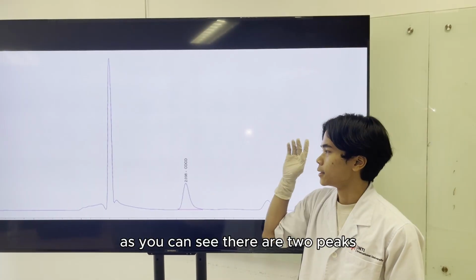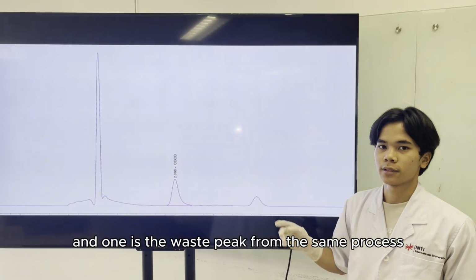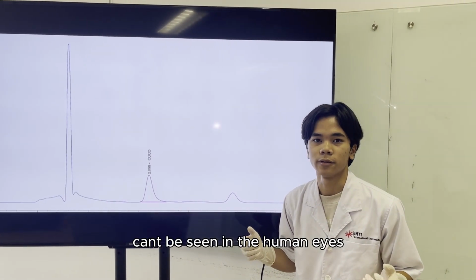So as you can see, there are two peaks. One is the drug peak and one is the waste peak from the same process. So the HPLC helps us to see what cannot be seen by the human eye.